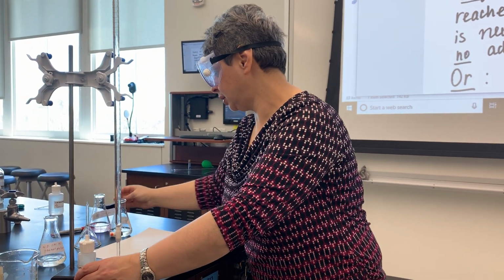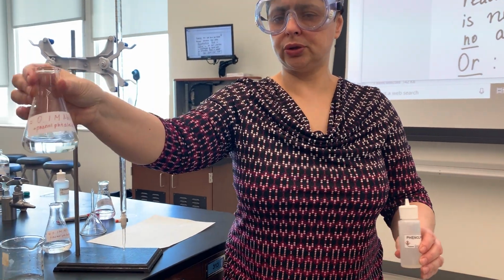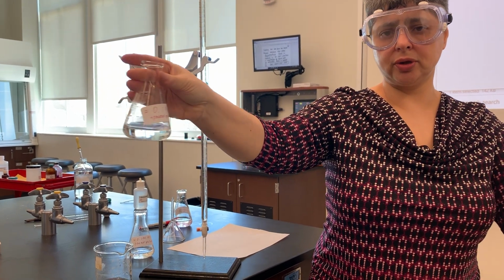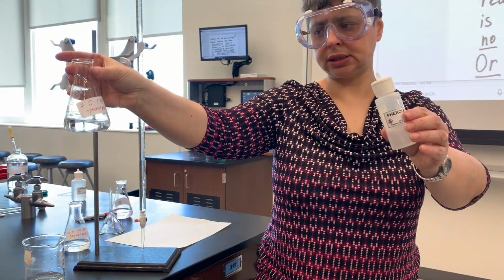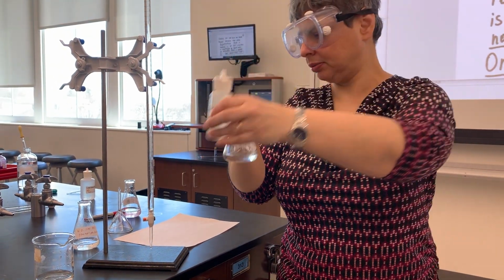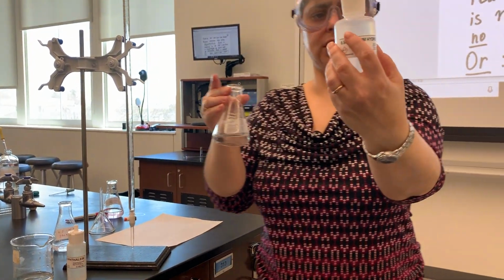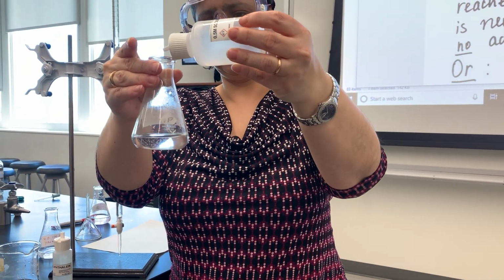And here I have some sodium hydroxide that I added to water, and I'm going to add some phenolphthalein. I'd like you to see what happens. So this is base. Oops, I'm spilling the whole thing. This right here is approximately 0.5 molar sodium hydroxide.